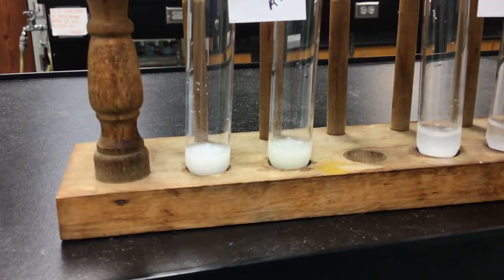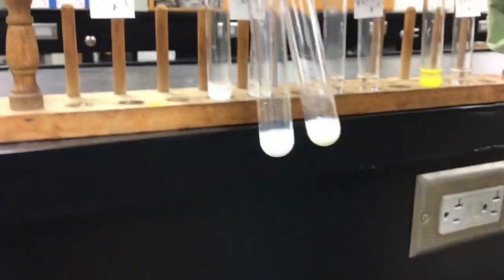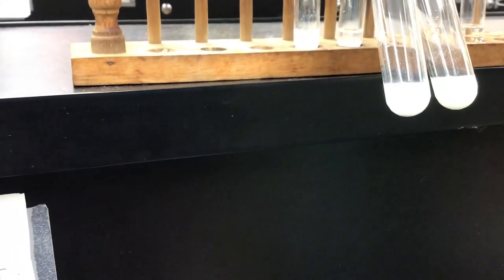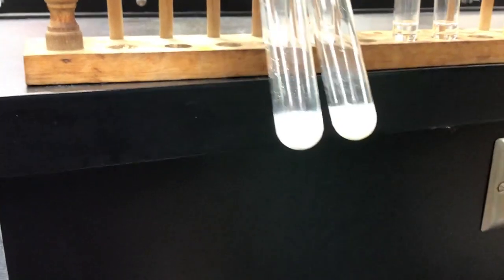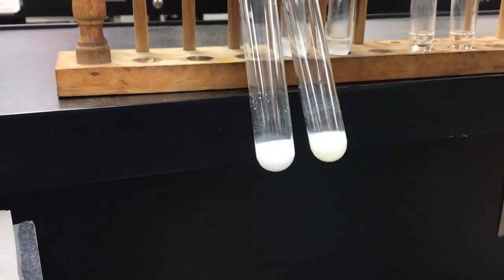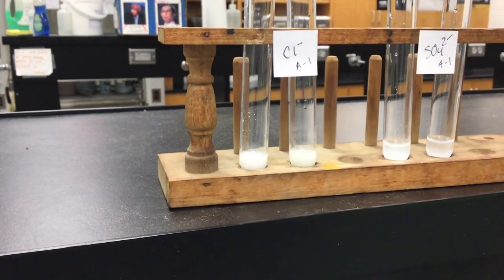I hope you guys can see this, but they don't look similar in real life, but on camera they're coming out pretty similar. It looks like the one on the right, your unknown, is more of a pearl color than the white that the known shows. So they probably are not the same result. You can barely see it there.